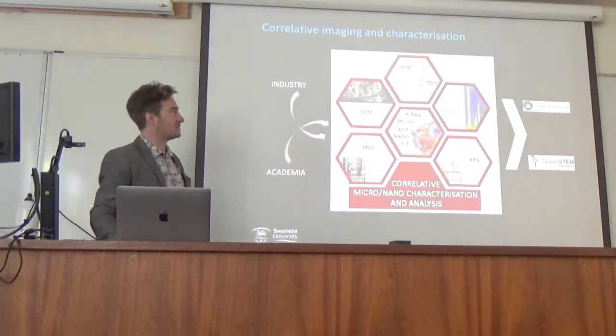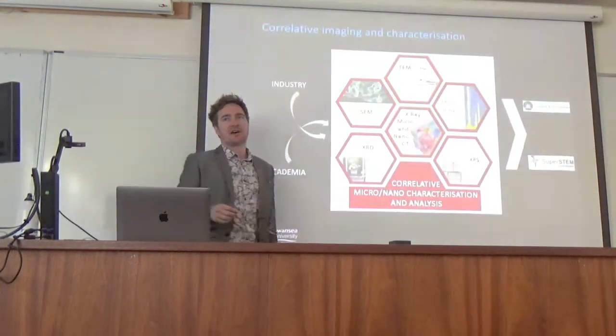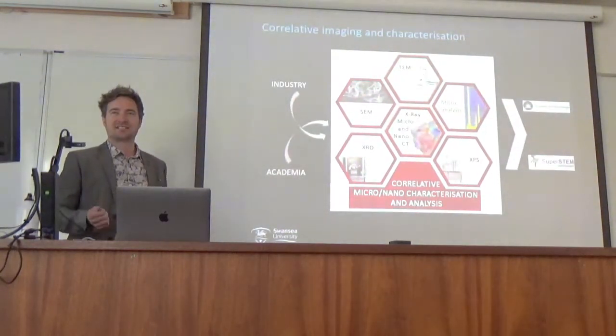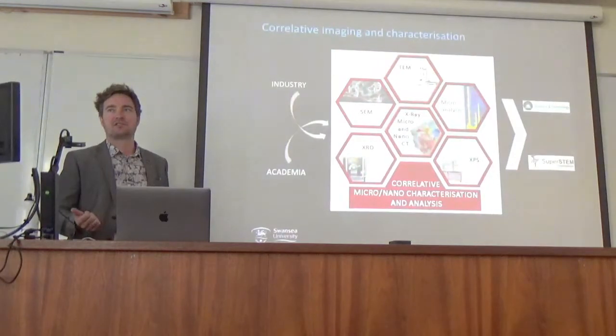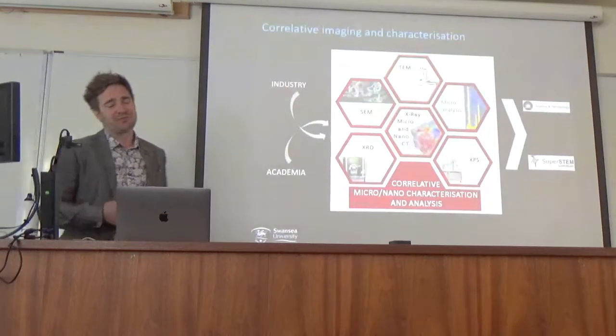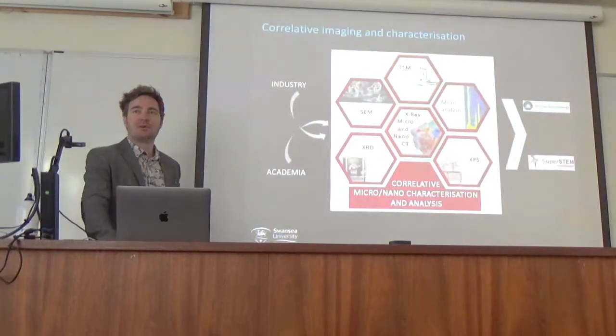We also link into STFC, the Science and Technology Facilities Council, so we link into things like Diamond Light Source and ISIS Neutron and Muon Source. We have our lab-based equipment to generate data, and then we reach out to other places to generate even more complex and larger data sets to try and deal with.